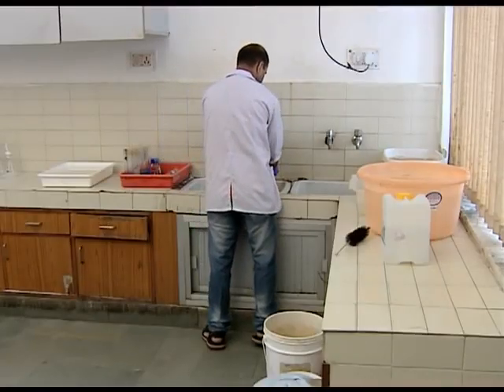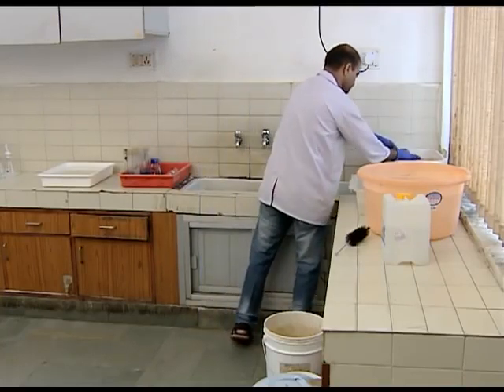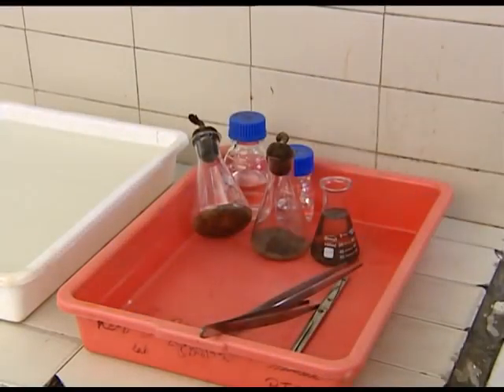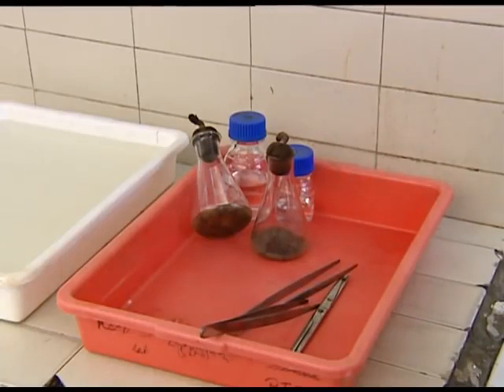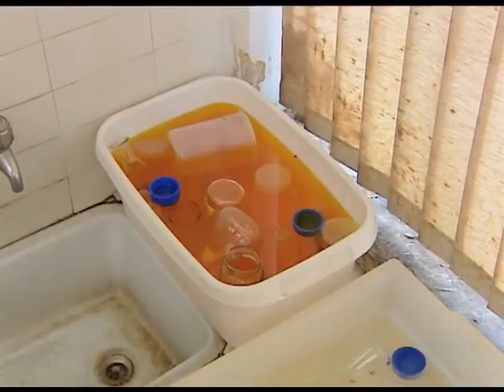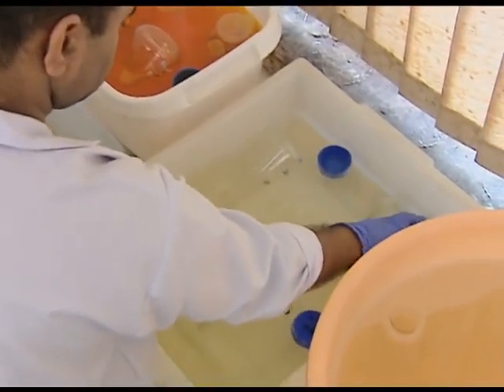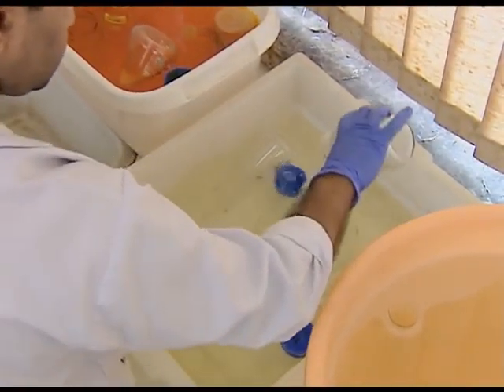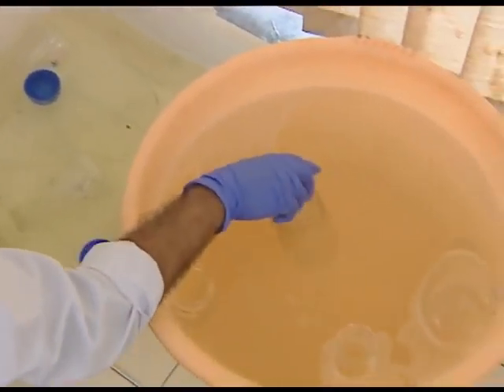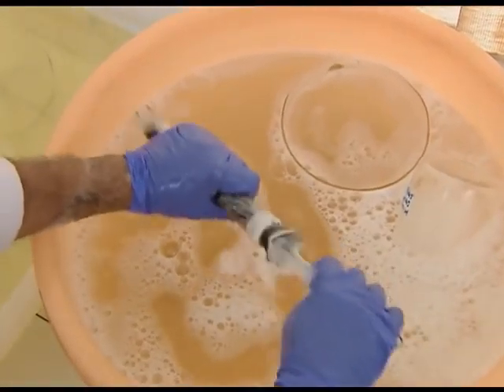Before using any glassware or plasticwares, these are first washed in a 4-step process. Firstly, all used glass and plasticwares with used cultures and media are autoclaved for about 1 hour. Then the glass and plasticwares are immersed in a tub full of chromic acid for 16 hours. After this, the glass and plasticwares are first rinsed with water to remove the chromic acid and then immersed in a tub full of detergent water and cleaned using hard nylon brushes.